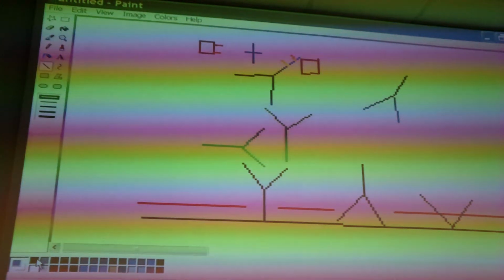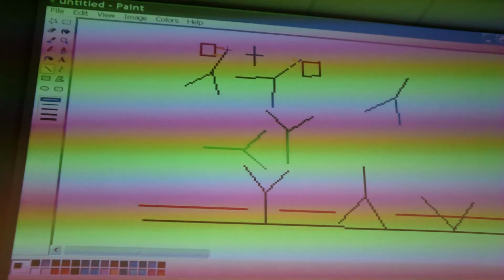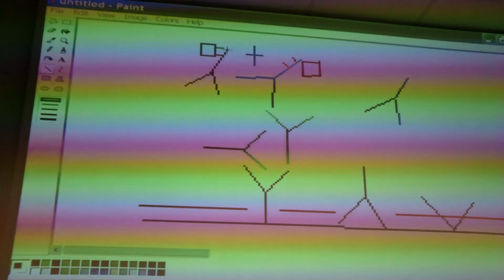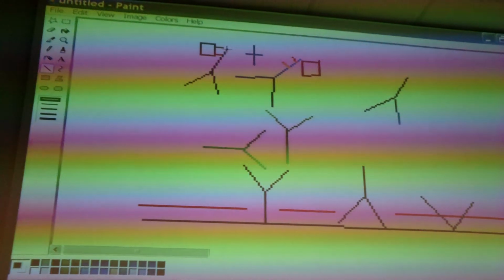If you had, for example, serum from this animal before immunization, without anti-human antibodies, to block unspecific binding, you can add these black antibodies, but unspecific, to the ELISA. That's why in a lot of ELISAs you will find the secondary with a low percentage, for example 1% of serum of the same species. So these are all ways to control background.